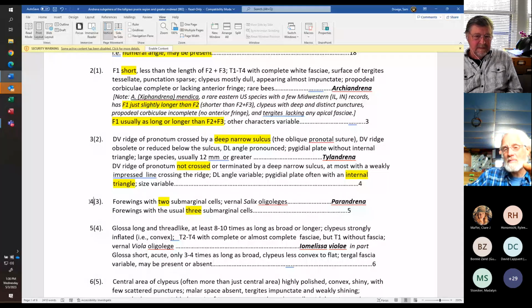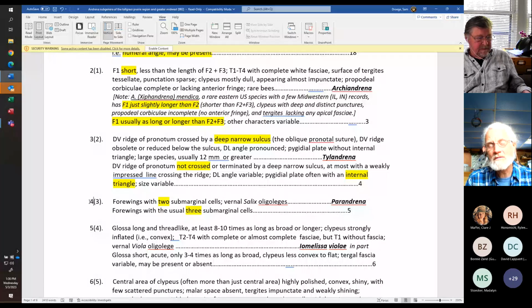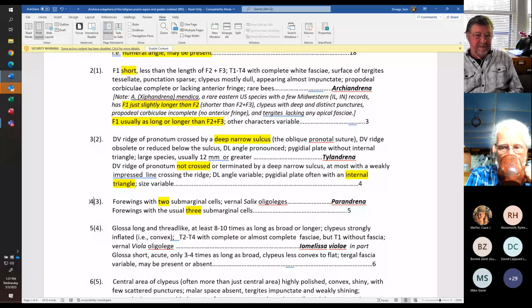They're talking about a molecularly based one, and we will wait and see, but you may not be able to get a very coherent morphological one, because that's what we're going to look at. We're not looking at their DNA. We're looking at things under the microscope. So I'm just warning people that just because they move things around doesn't mean it's going to make it easier to ID. It's probably the opposite, and making this relevant way into the future, I would think. Agreed. All around agree. It's just the way science works.